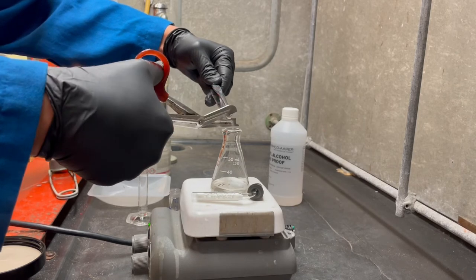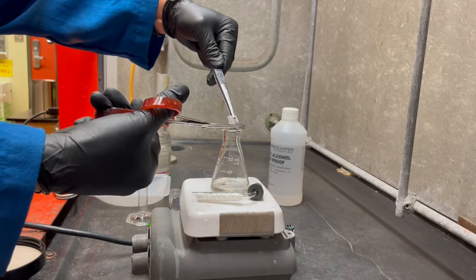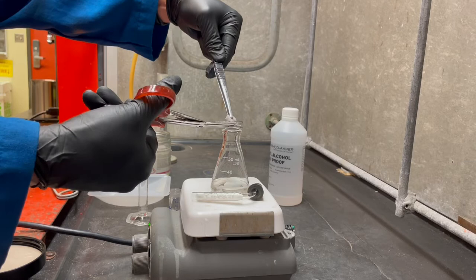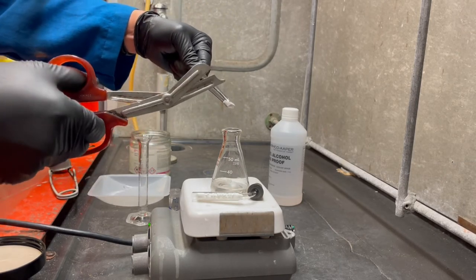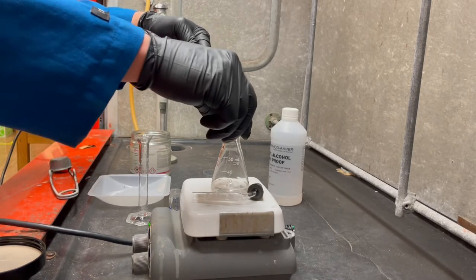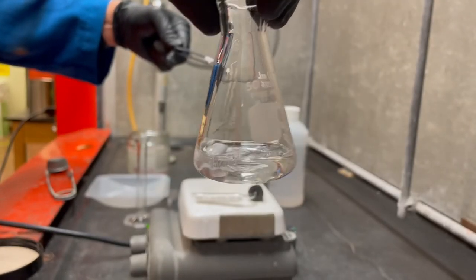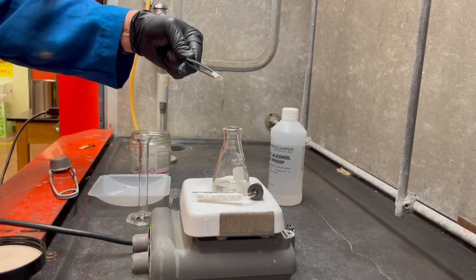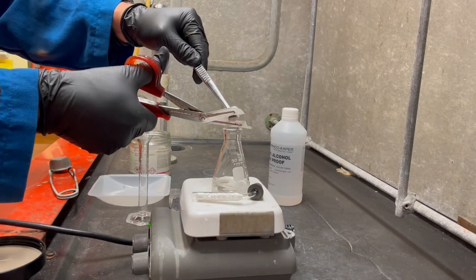So what I'm doing here is I'm cutting the sodium directly into the ethanol because I want to minimize the amount of time that the sodium is exposed to the air, right? Because there's so much water in this humid air that it just oxidizes the outside. And if it oxidizes the outside, it creates almost like a protective layer. Ooh, check out them bubbles. There you go. It's doing its job. But if it oxidizes the outside, it just takes longer to react with the ethanol. And I ain't nobody got time to wait around for this.